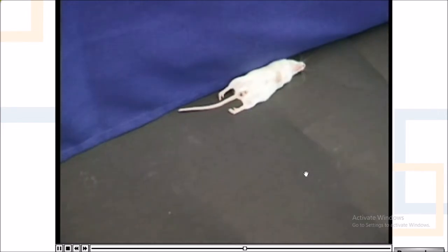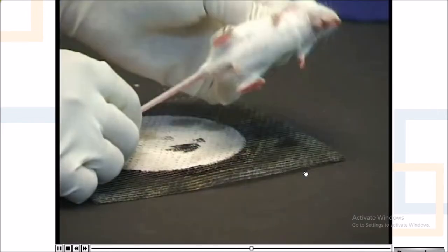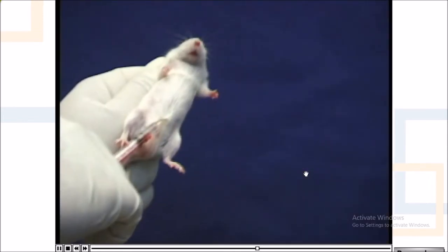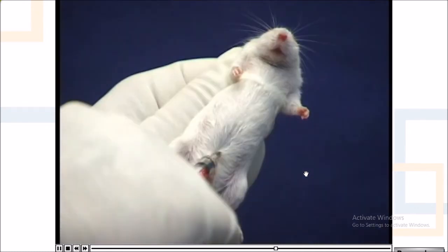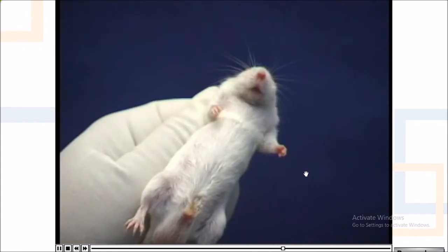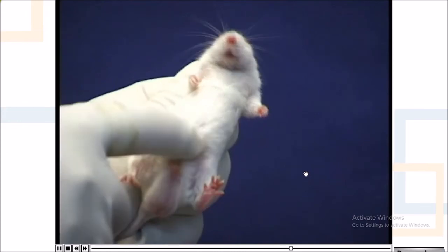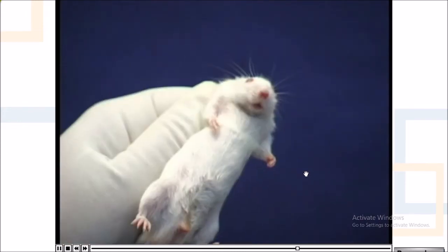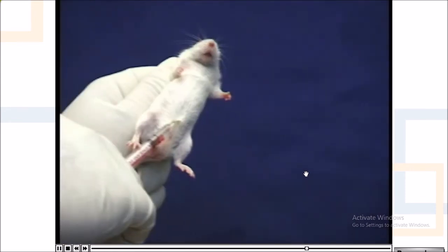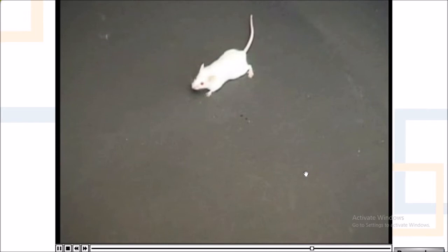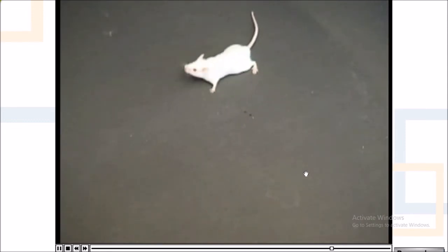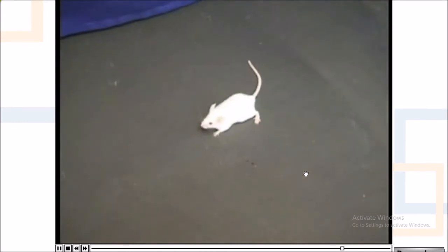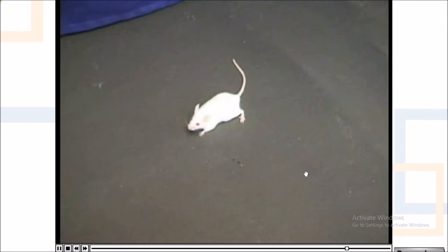These clonic convulsions finally lead to the death of Mice A. Inject 0.2 ml of Diazepam solution intraperitoneally to Mice B. After half an hour, administer 0.1 ml of Strychnine sulfate solution intraperitoneally to Mice B and observe the onset and severity of convulsions. The severity of convulsions such as Straub's tail and whole body movement is less in this mouse, suggesting that Diazepam protected the mouse from the convulsions induced by Strychnine.